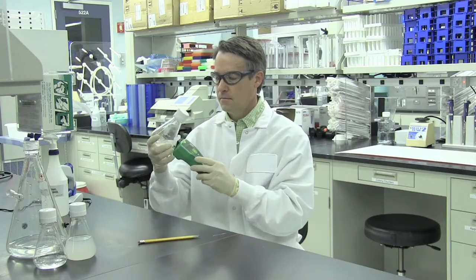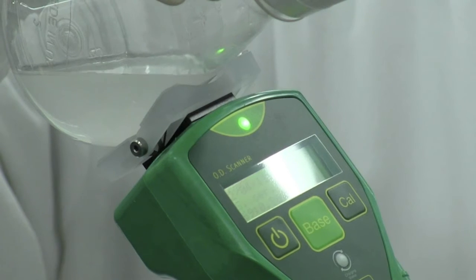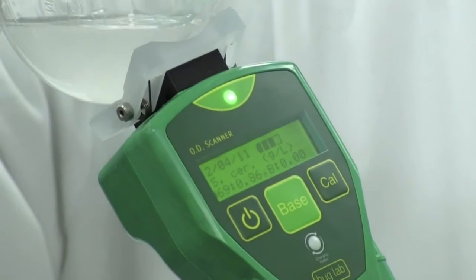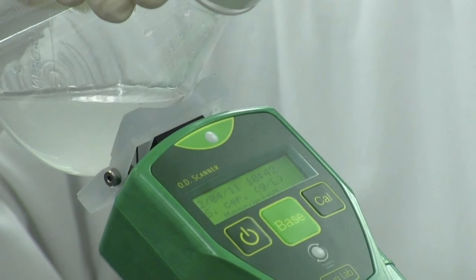In an effort to prevent inaccurate results from being reported, several error detection algorithms are employed. The error message "unstable contact" will be displayed if the vessel is not kept in constant contact with the sensor for the full measurement period of 2 to 6 seconds. The speaker will play a series of 3 low dissonant tones, and the measurement indicator LED will turn red. The error message will clear after 3 seconds. However, it is not necessary to wait for the error message to clear before starting a new measurement.